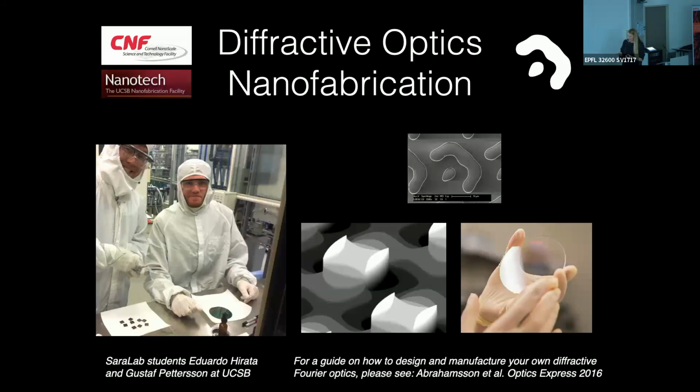And these are not very exciting. They just multiplex a beam if you look at them. We used to have some really fun ones, but I think my students have all of them, little Pokemons. So here I send the beam through this grating and I get all of these orders out.